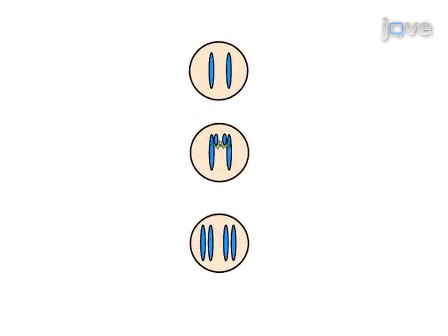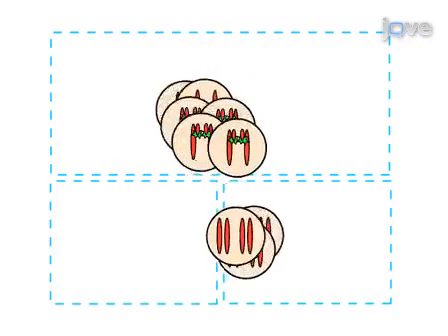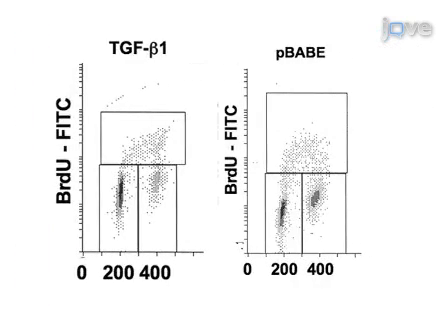Next, stain the BrdU in the cells that have incorporated the reagent. Then, the DNA is stained with propidium iodide. The final step is to evaluate the proportion of cells in the different phases of the cell cycle by flow cytometry. Ultimately, the cell cycle distribution of a population of experimental cells can be visualized through flow cytometric analysis of BrdU-labeled cells.